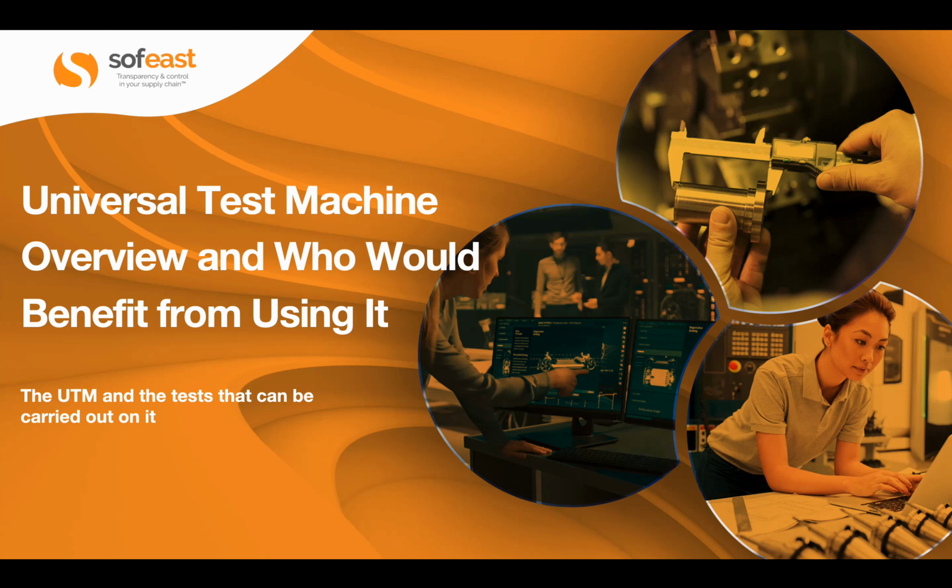In this video we're going to be looking at the universal test machine. It's going to be an overview and we're going to be looking at who would benefit from using it.